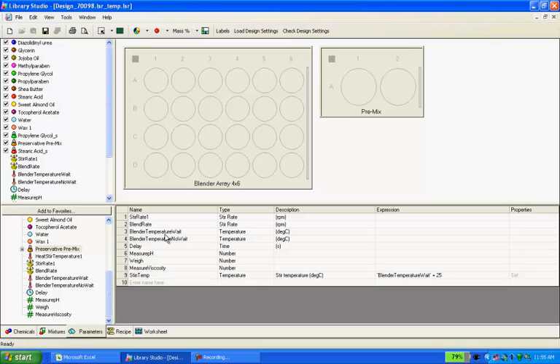So these parameters are actually the process steps, as you can see here: stir rate, blend rate, blending temperature, or wait time when you are blending, measuring pH, or weighing the vial, measuring viscosity, etc., which are basically mapped to the library. And then these parameters are read by the Automation Studio software, which basically executes a particular physical step to create the data that you want to get from this library.